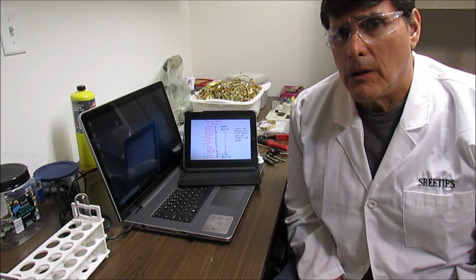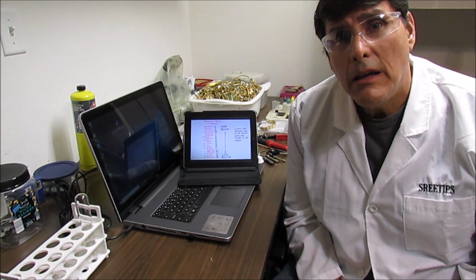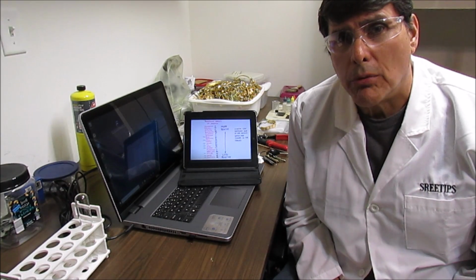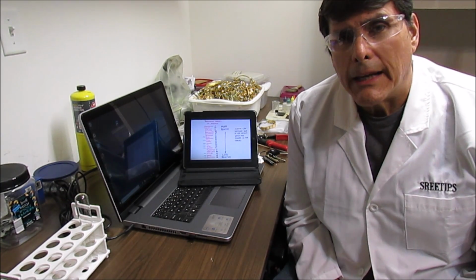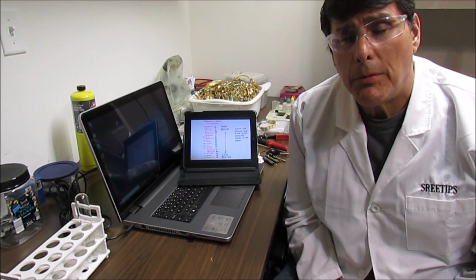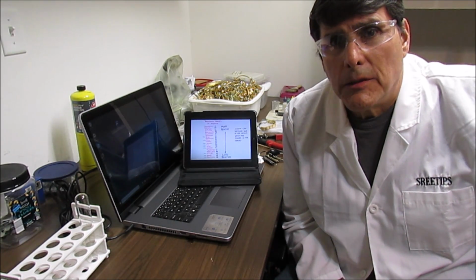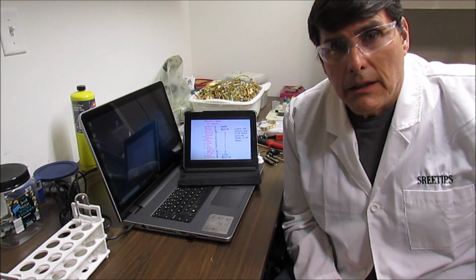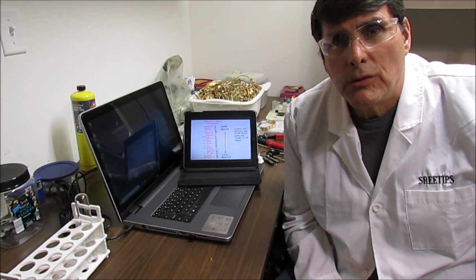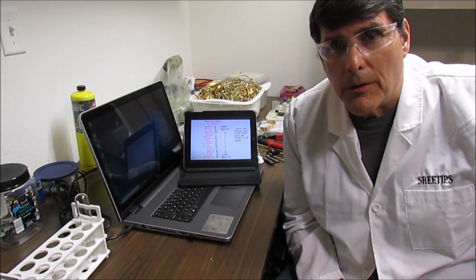alternative, based on those tests out there, would be to add some DMG to the solution. I still got to filter it. I will filter the solution out before I process it any further. But I could add some DMG and get the platinum group metals to drop with the DMG. But based on that test out there, I've seen some green precipitate in the DMG test, which tells me that copper is also precipitating out. So it just drags the copper right with it, it appears.